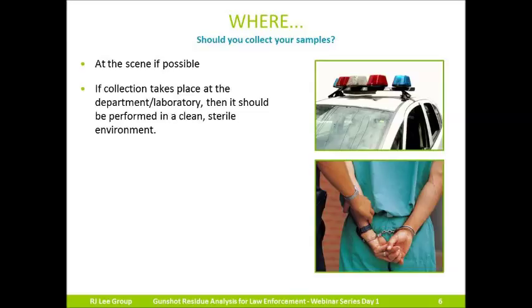When you cannot collect at the scene, it is very important to bag the subject's hands. A brown paper bag over each hand of the subject will protect against any possible contamination that could originate from a police officer's handcuffs or from the back seat of a police vehicle.